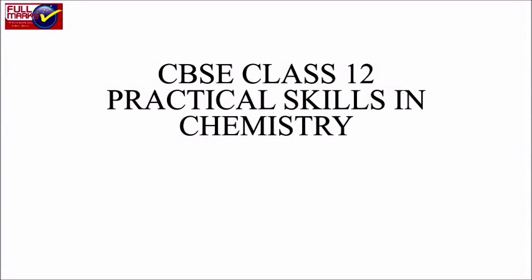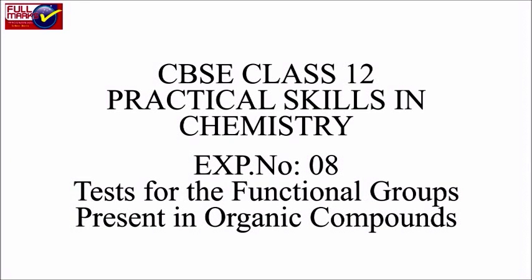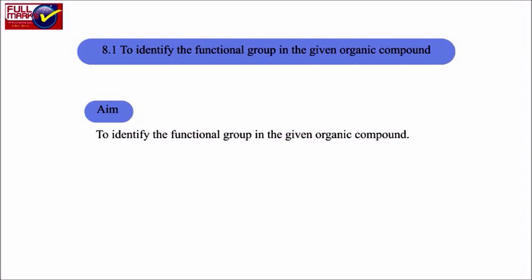CBSE Class 12 Practical Skills in Chemistry. Experiment number 8. Test for functional groups present in organic compounds. 8.1. To identify the functional group in the given organic compounds. Aim: to identify the functional groups in the given organic compound.